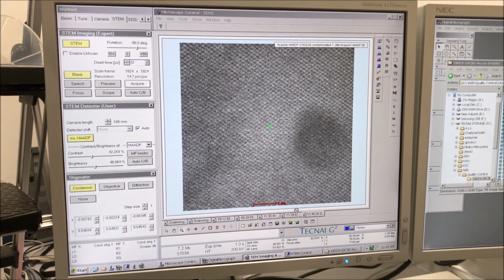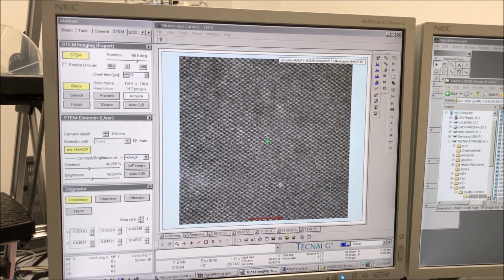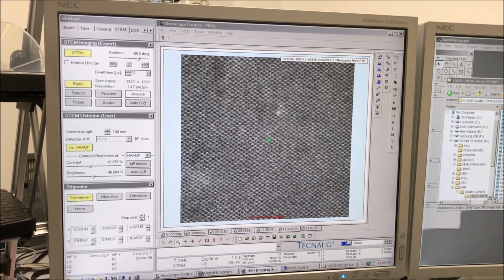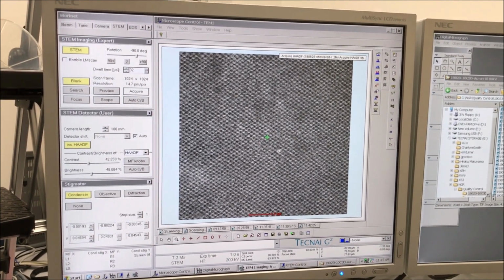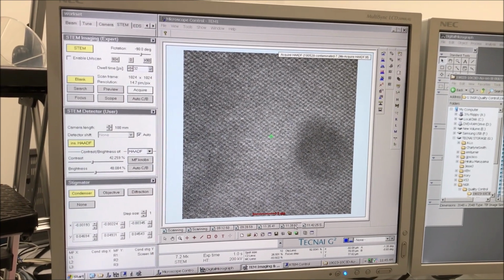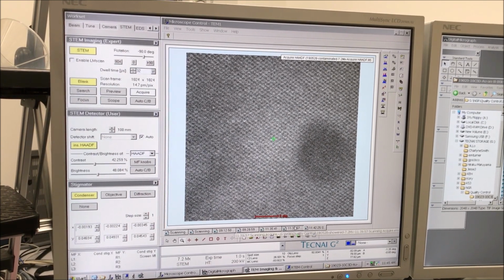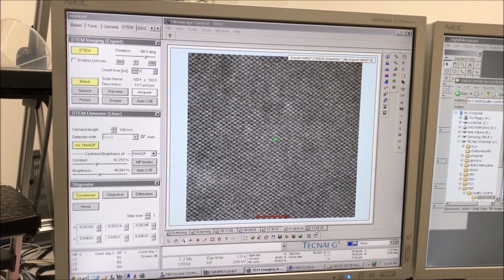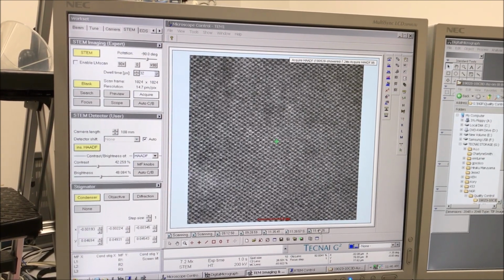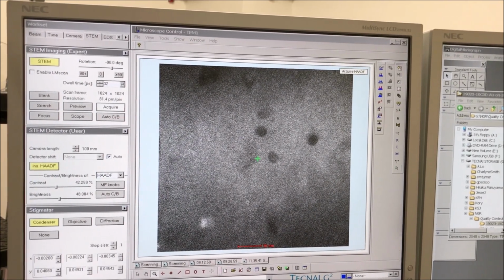But then after doing the shower, this is what it looks like. That's very, very markedly improved in terms of the contrast and the separation and the features that can be observed as a result of doing the shower, between here and here. So take a look at that difference. Showered, no shower. Showered, not showered. So definitely we got a benefit from doing the shower.